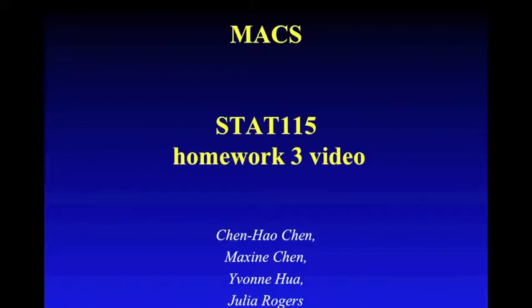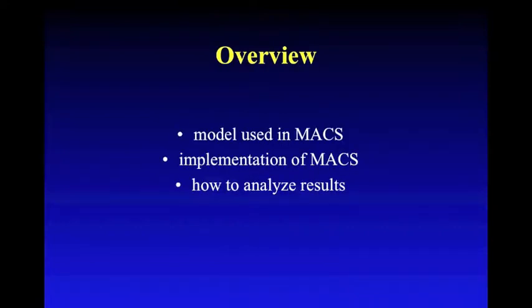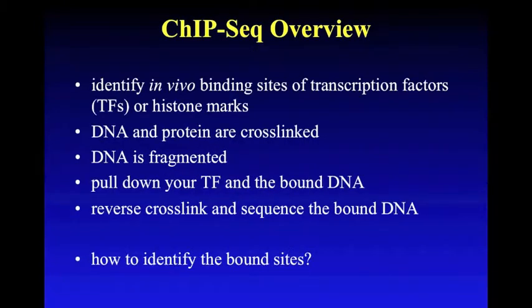In this video, we'll give an intro to MACS, which is Model-Based Analysis of ChIP-seq. First, we'll give an overview of the model used in MACS, and then go through how to use MACS and analyze the results.